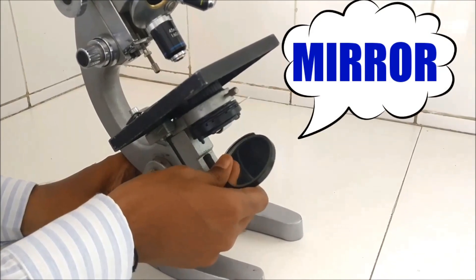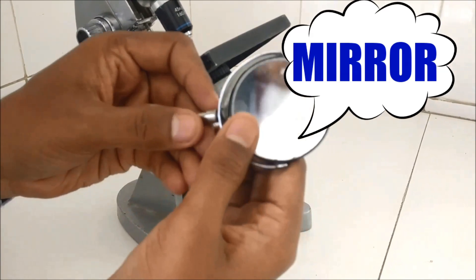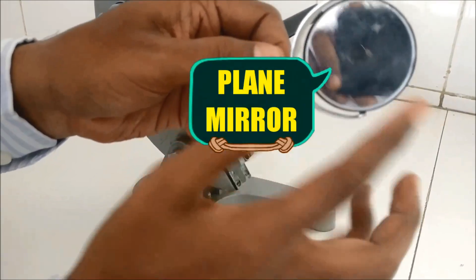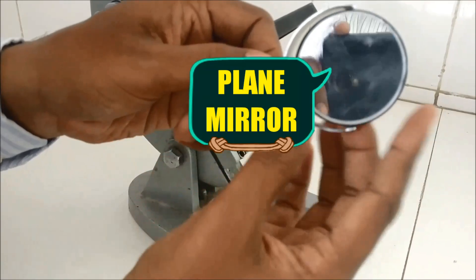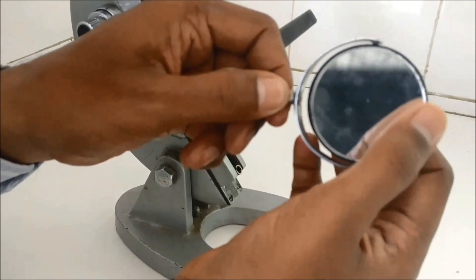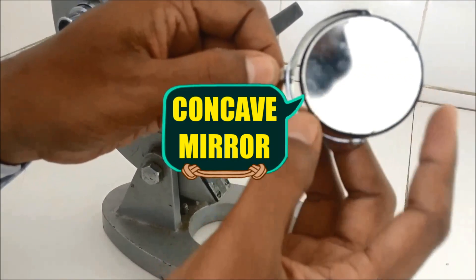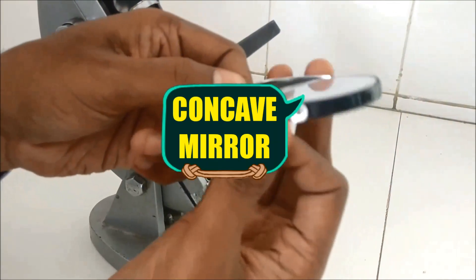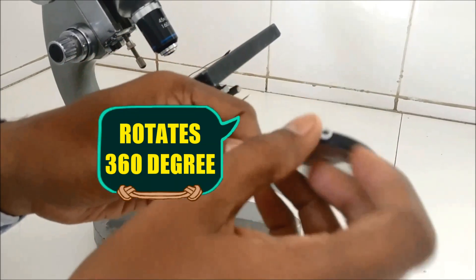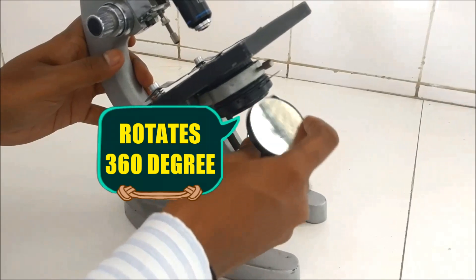The mirror is very important — without it you cannot see anything under the microscope, because it reflects the light. The mirror rotates 360 degrees. Never move the microscope to catch light; instead, rotate the mirror so that light falls on it. It has two sides: a concave mirror and a plane mirror, used depending on the intensity of light available. By moving your finger on the mirror you can feel which side is concave and which is plane.